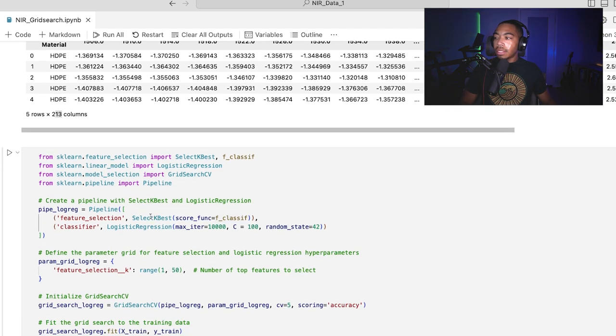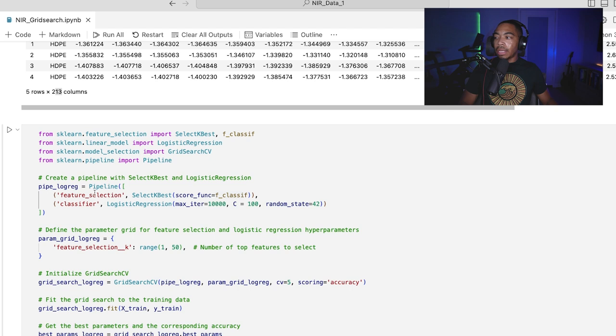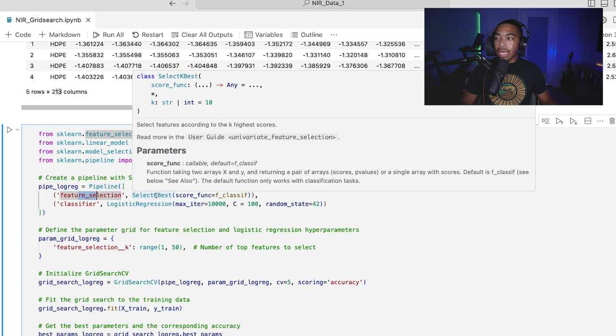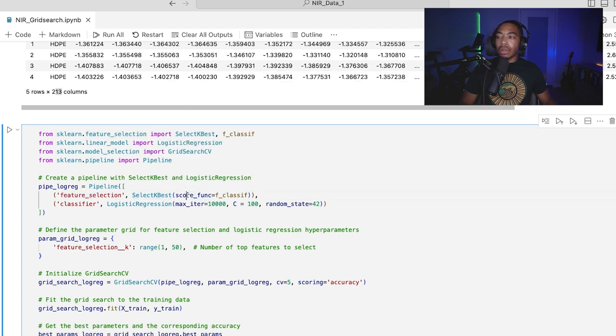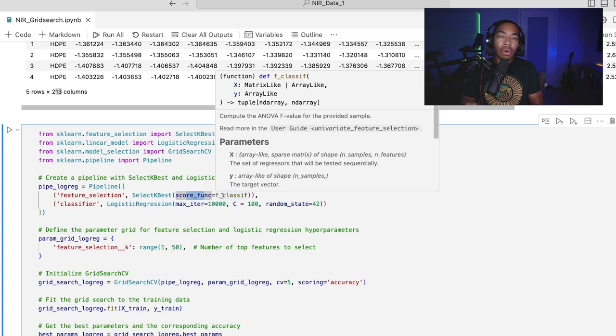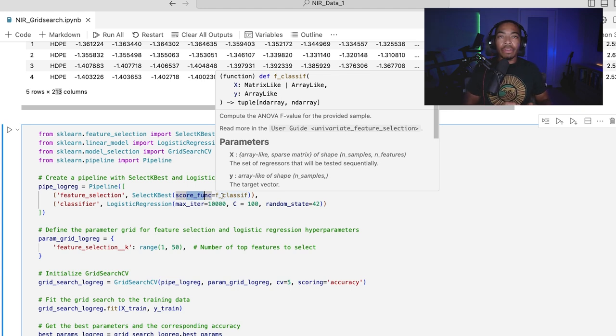We could do that by creating our pipeline here. So our first step is feature selection. We're going to use the SelectKBest, and then our scoring function will be this F_classif, which essentially computes an ANOVA or F-value for our different variables.